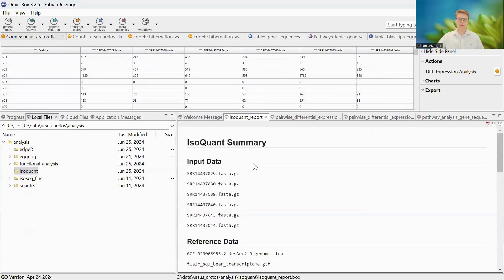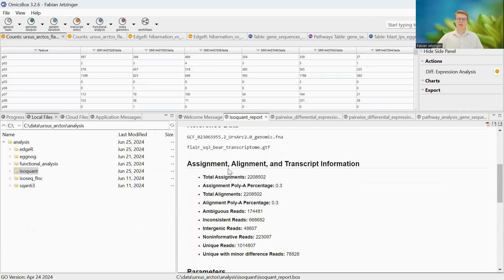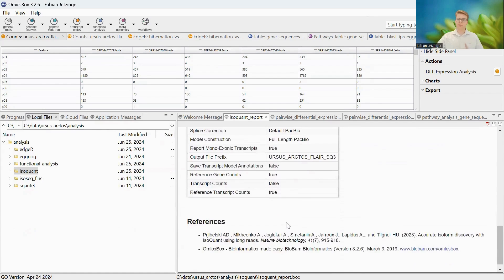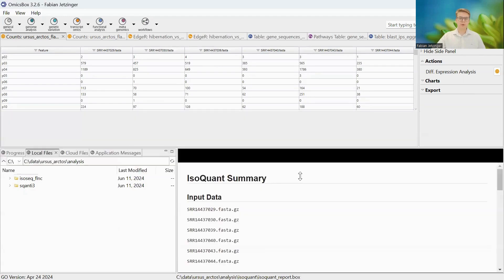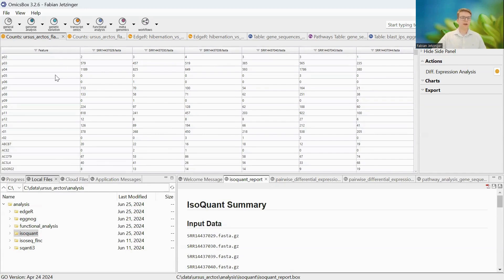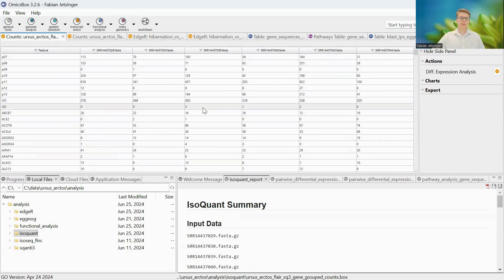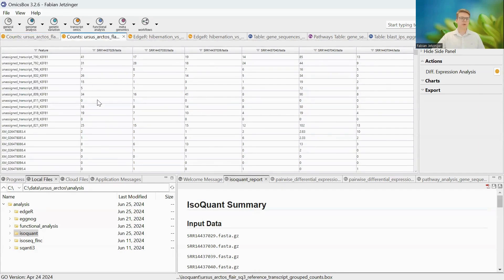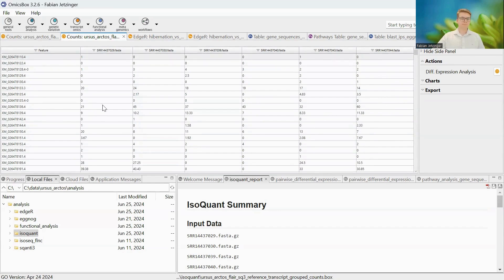I've already run the analysis ahead of time and can skip to the results. First, there is an IsoQuant summary report listing all input data, reference data, basic read statistics on assignment and alignment, and the parameters used — useful for tracing back which files and parameters were used. Then we receive our actual quantification data: a count table at the gene level with counts for each gene across six columns for our six samples, and a very similar table at the transcript level where each line is a transcript.